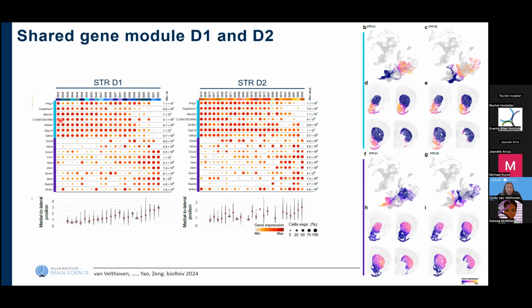Now, when we look at the genes that are underlying these components, you can definitely see that there is some kind of gradient across the different cell types that we've identified. The dot plots are purely based on the single-cell RNA-seq data, the same as these UMAPs. On top is that same gene module colored onto the UMAP in the single-cell RNA-seq space, and the same gene module painted onto the Merfish data. So this helps us understand how different spatial gradients exist within our data set.